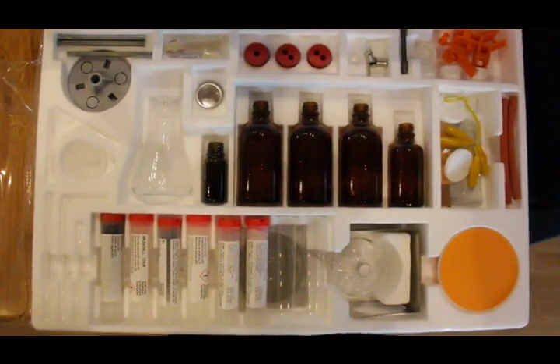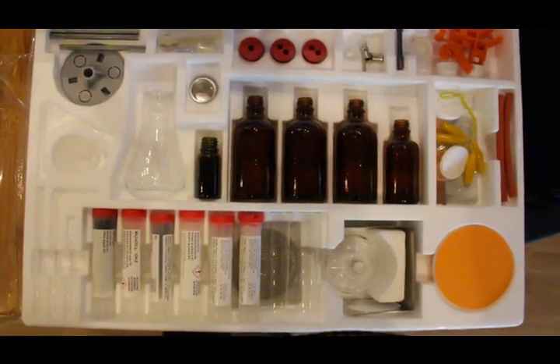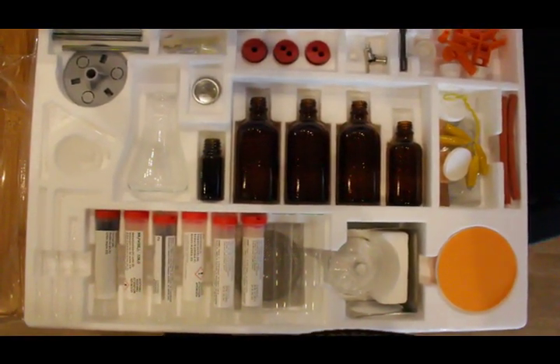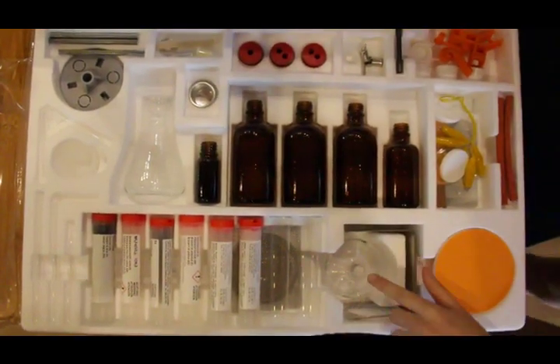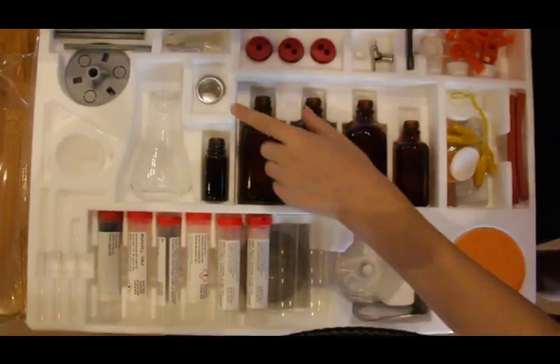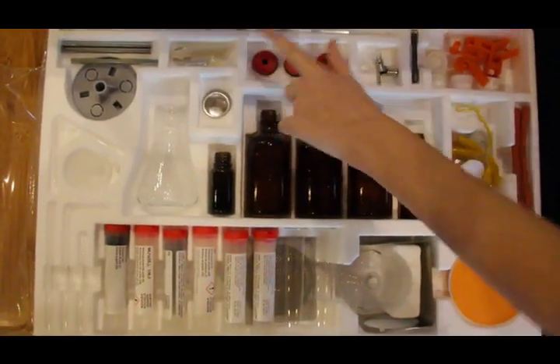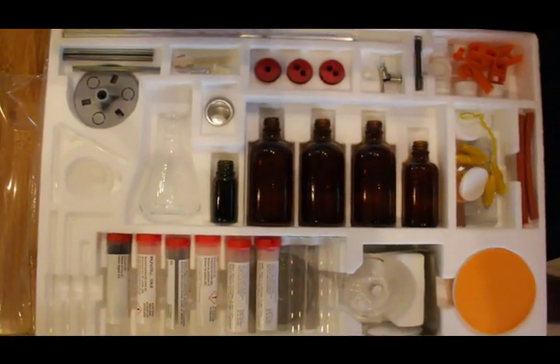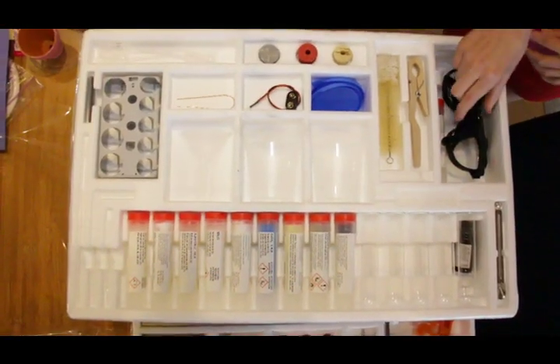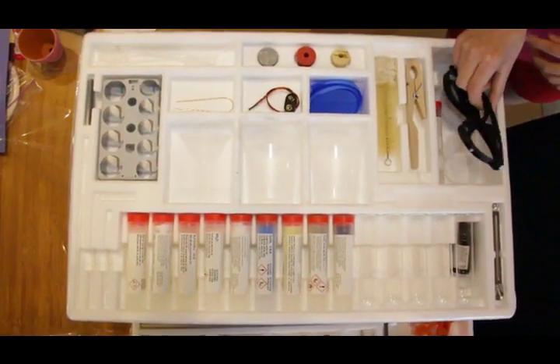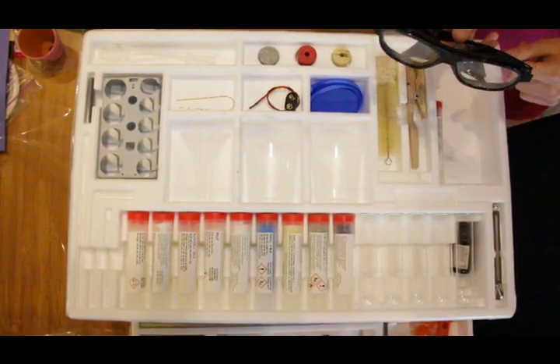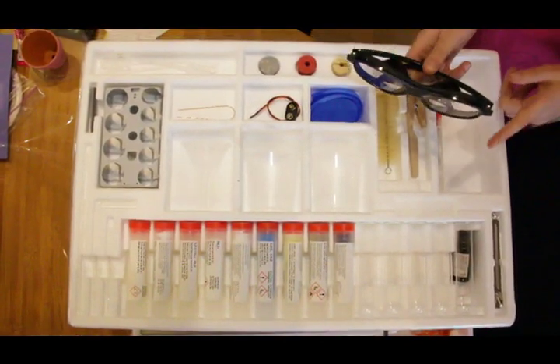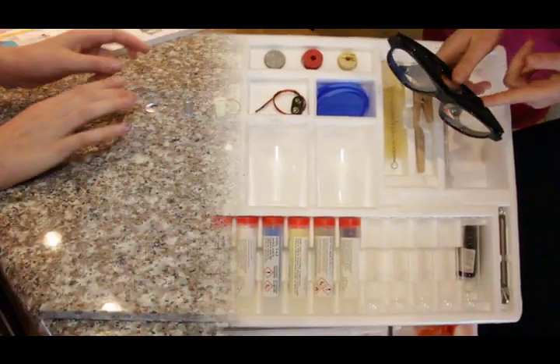To do so we will be using the burner piece right here, the cap, and then these pieces right here. And of course the most important piece of the kit is safety goggles or safety glasses with side pieces.